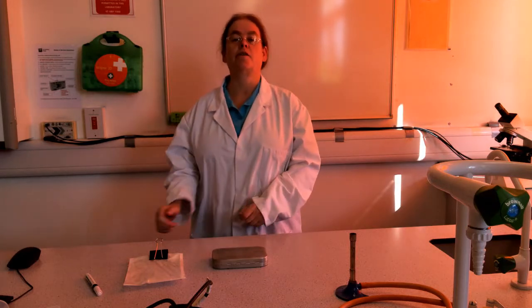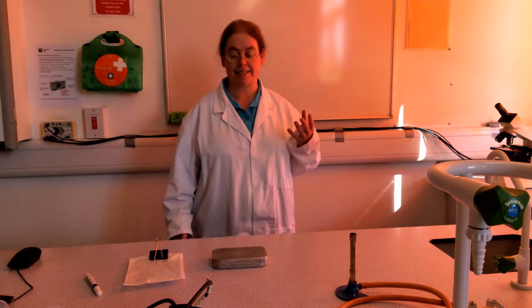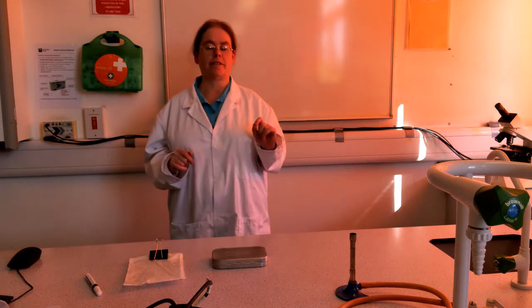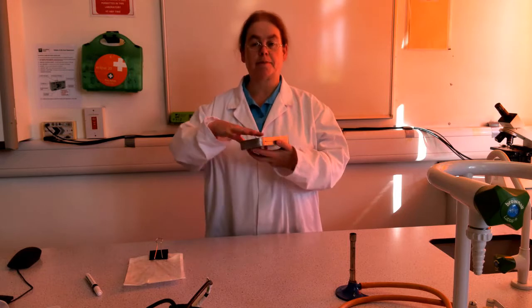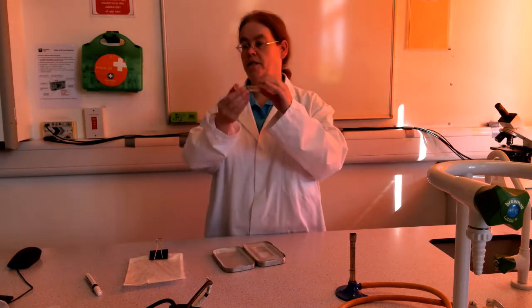And of course also you have to add some sort of dye that will show up the bacteria. It works better for things like human blood cells or large microorganisms like yeast that you can really see. But anyway, ways have been found to get around the, have I counted that one, problem. And that is this special slide called a haemocytometer.